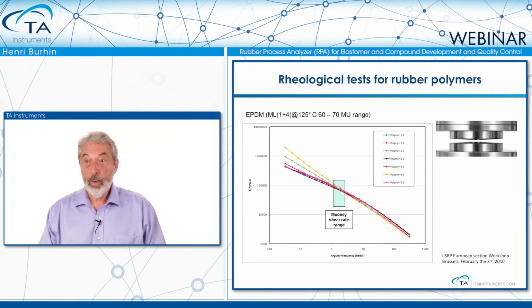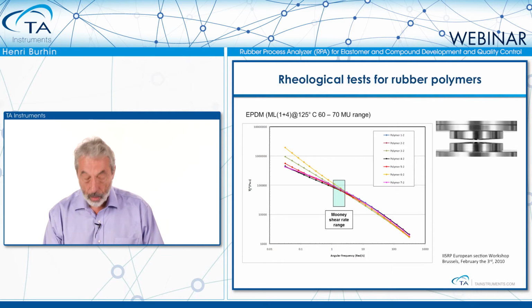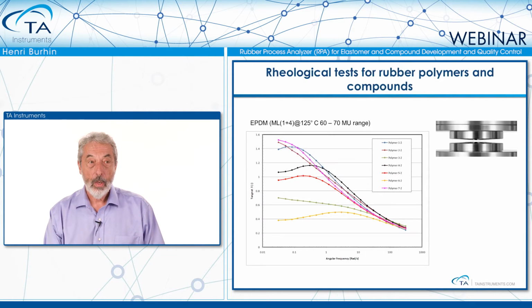So that means nobody can expect a polymer giving the same processing characteristic as another. Now, it is to be understood that, all these polymers being from the same family, theoretically a compounder can switch from one to the other, expecting the same behavior.